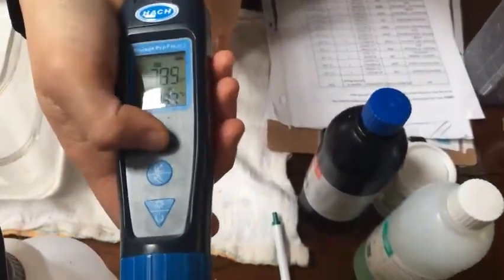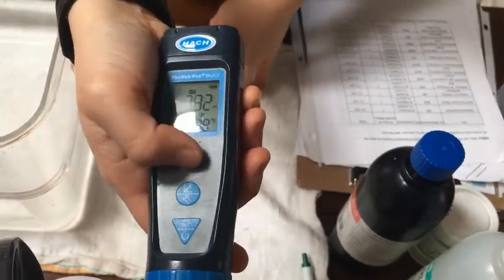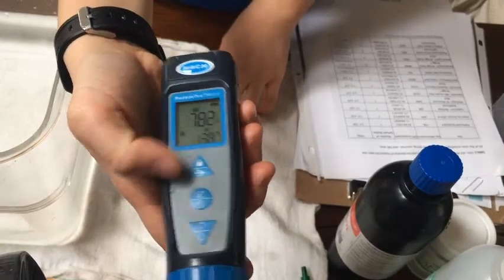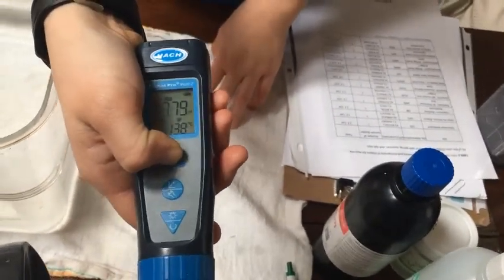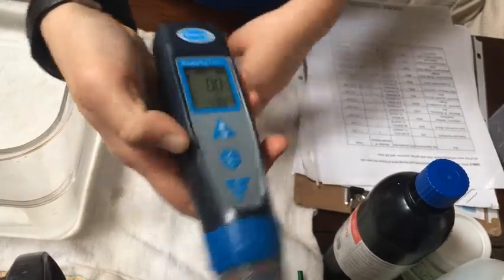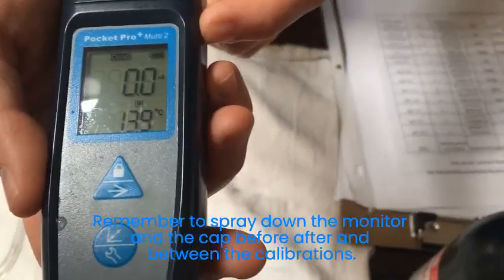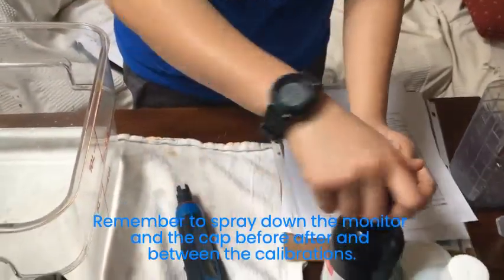Since we're still on pH, we're going to need to switch over to conductivity. Again, you just hold this bottom button down. If you accidentally tap it, it locks — just tap it again to get out. Hold to change. Now it says conductivity, or C-O-N-D, and you do the same thing.